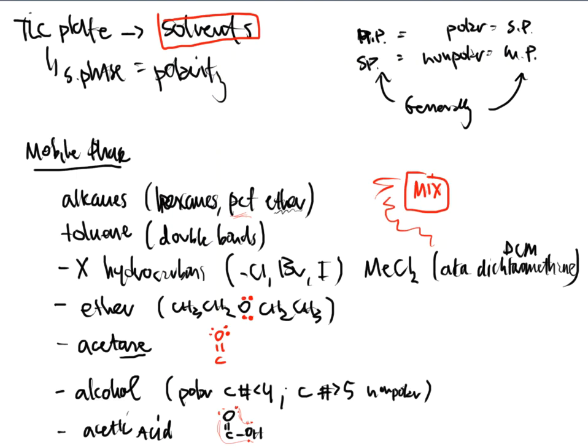So again, it's two sides of the same story. We've talked about the stationary phase, and now we've talked about the mobile phase. Both of them are as important. Both of them need attention, and you need to make sure that you carefully choose both of them in a laboratory to separate your compounds.